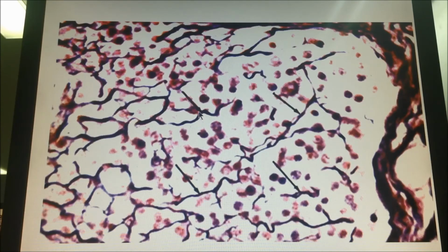Who does this? It is the reticular fibers. This is a reticular connective tissue. Reticular means network or a framework. The reticular connective tissue forms the framework of the lymphoid and soft organs in the body, which are the liver, the spleen, the lymph nodes and the bone marrow.